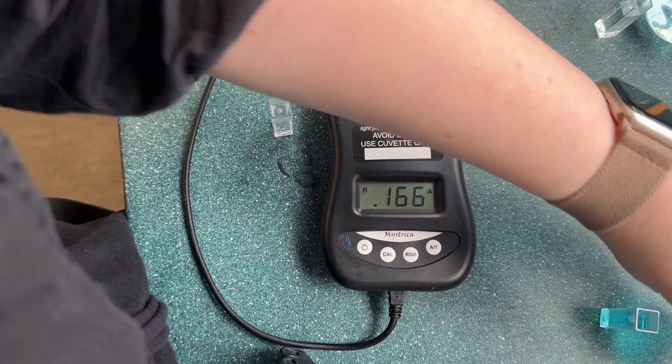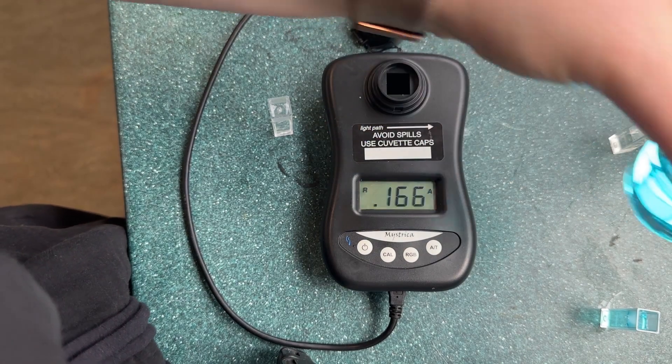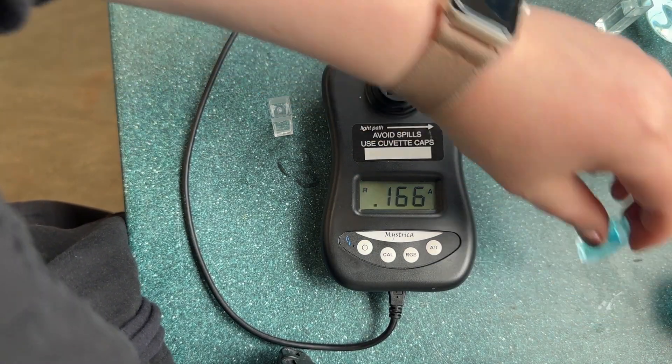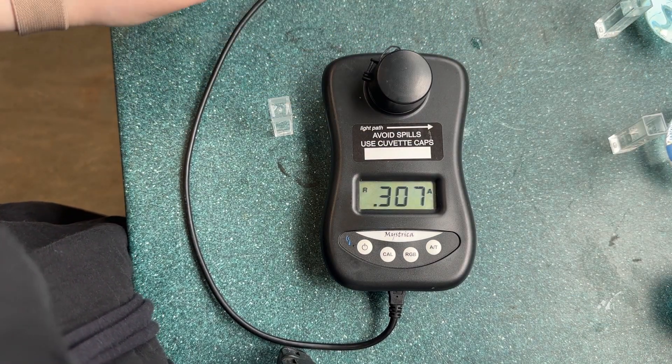We're now going to take a solution which has been diluted by an unknown amount. We put this into the colorimeter and take the reading.